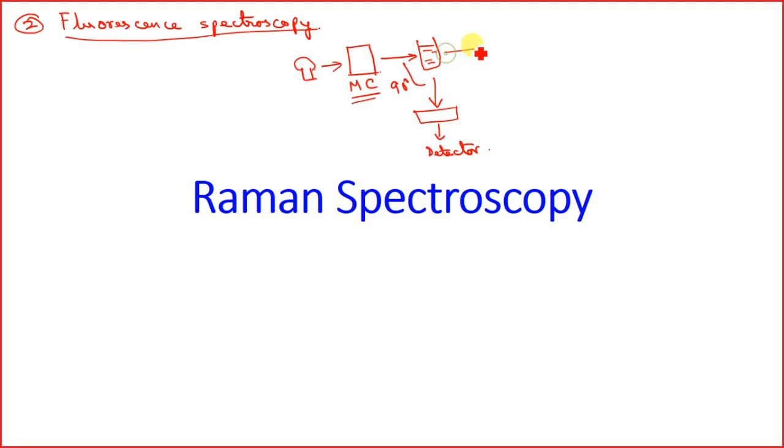Okay, so the majority of the light which is being generated by the source will pass through, and only the fluorescence, which is not following any directionality, will be emitted in all the directions including at the 90-degree position. Okay, so in that case, the light with which you are exciting the sample, you are minimizing the effect of that particular light.